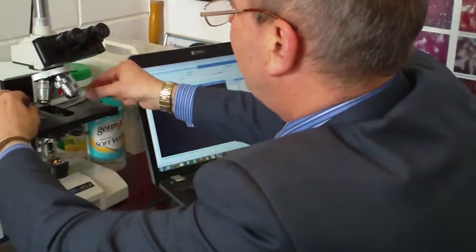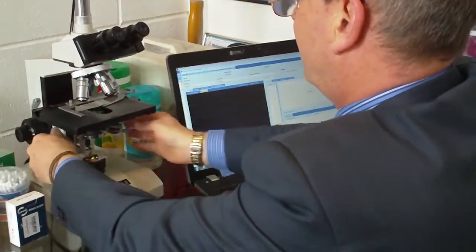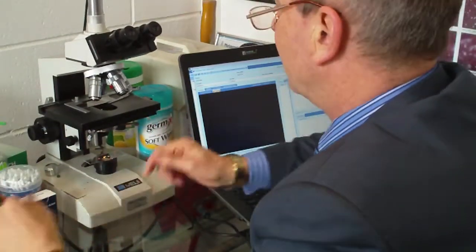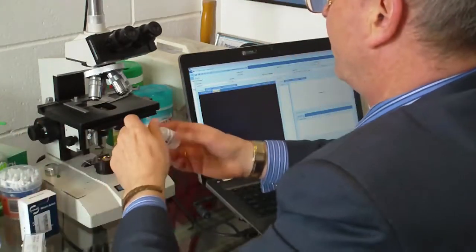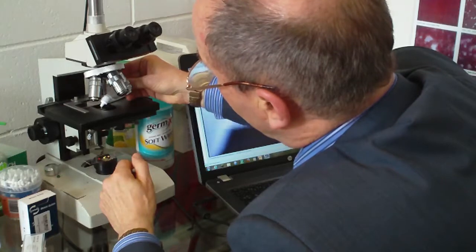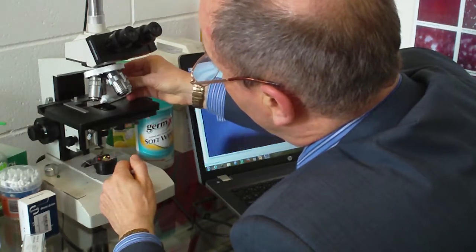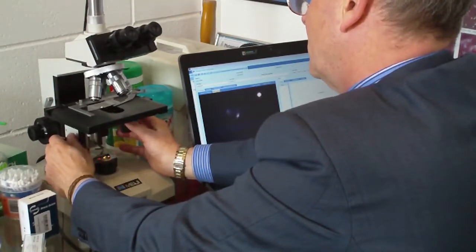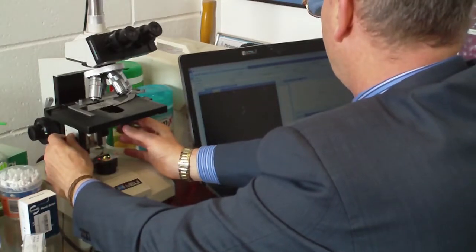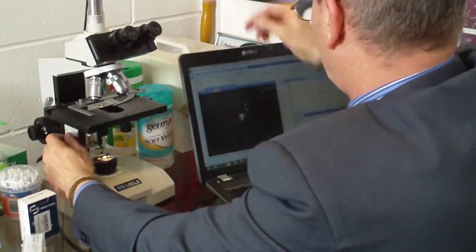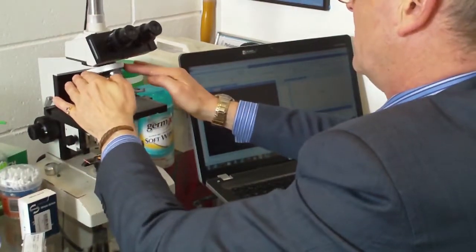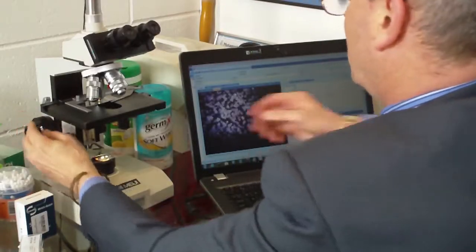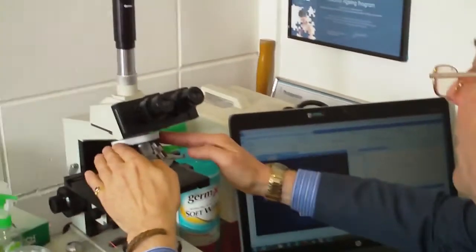Okay. So we're putting the sample on the machine. The dry blood is drying down here. And we'll just get a little bit of oil on the objective condenser. This is to make the resolution sharper because it's a research grade microscope, $20,000 microscope. And we're getting the picture nice and sharp. So we're just focusing on low power first just to get a decent picture. That's the blood on low power. And then we go into high power.